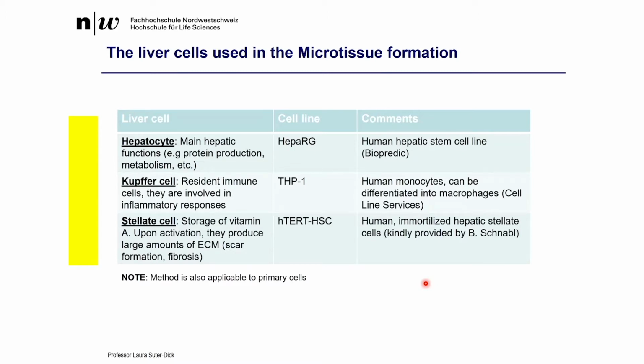To note is that the way we are working with these three different cell lines is applicable also to other cells. We don't need to use these cell types. We can also work with primary cells. This works as well.